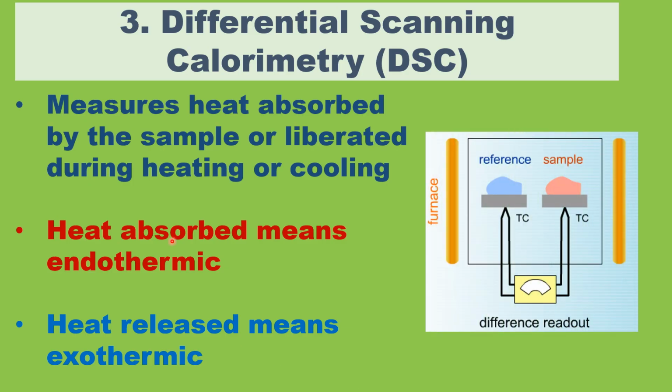This is the experimental setup, the same setup used for DSC also. In DTA and DSC, the experimental setups are the same, because in DSC heat is measured, whereas in DTA temperature is measured.